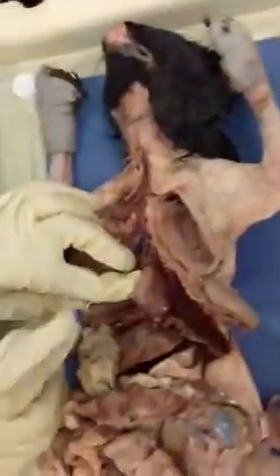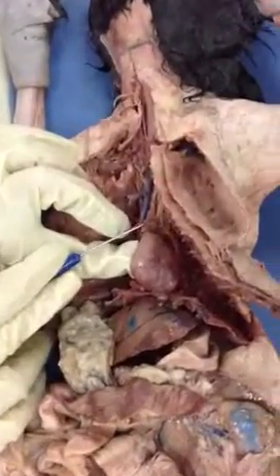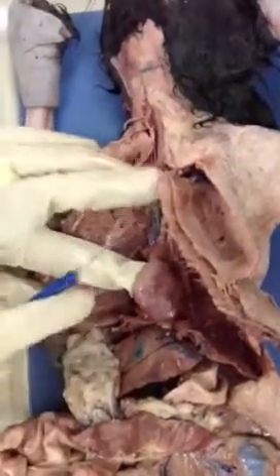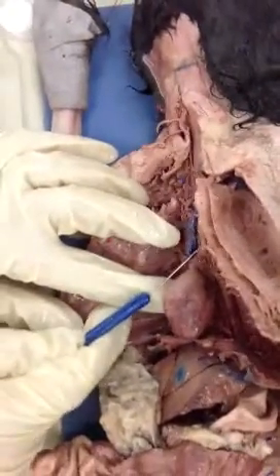Now we're going to go over the blood vessels. Here I see this notch here, right? So what is this, please? Aorta. Now, the branches of the aorta, the first branch of the aorta is this one. What's the name of it, please?